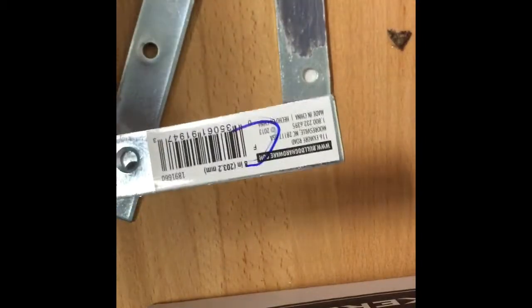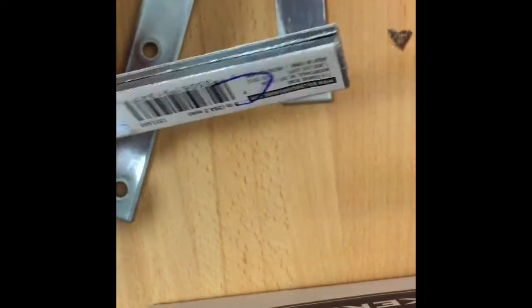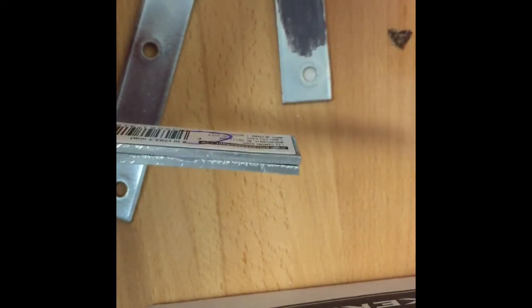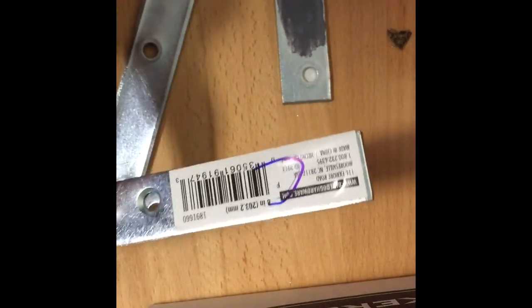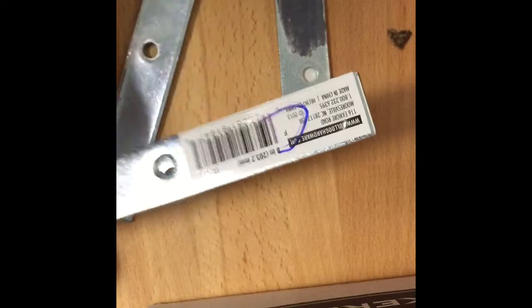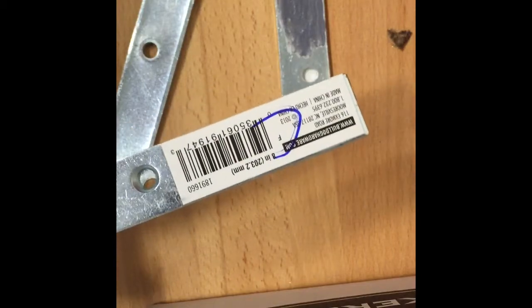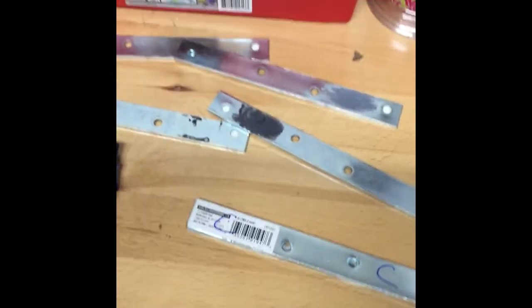At the very least, this does turn around and show that the diamine, by virtue of the fact that C is sticking together, I'm sure I could pry it apart if I wanted to by using like a screwdriver or something. Oh, that's interesting. The diamine was the main product here. Because this is the one that's sticking, we can see that the diamine becomes absolutely more important in the completion of the cross-linking process. Huh. Kind of surprised this one didn't stick better though. Well, this concludes my experiment.